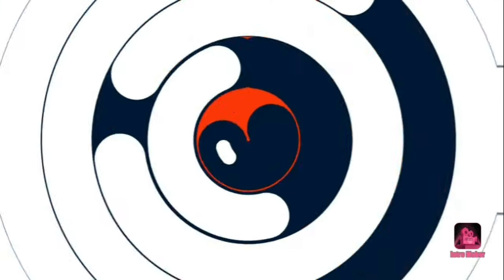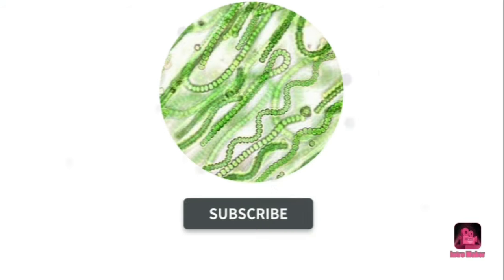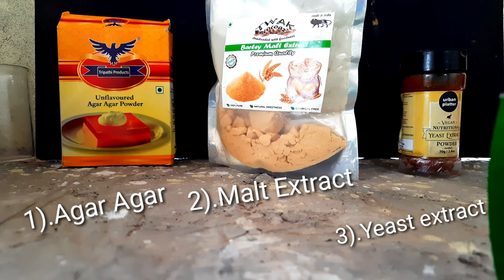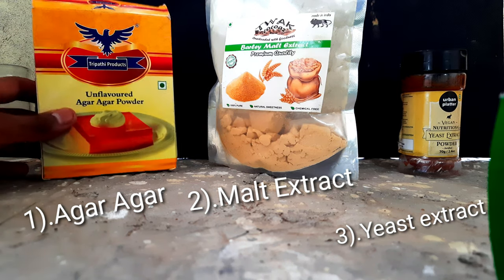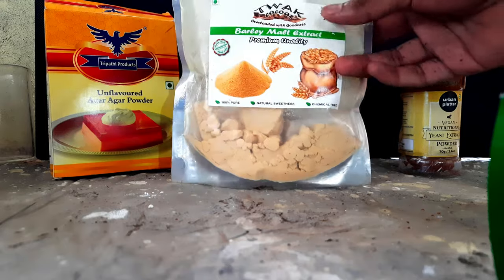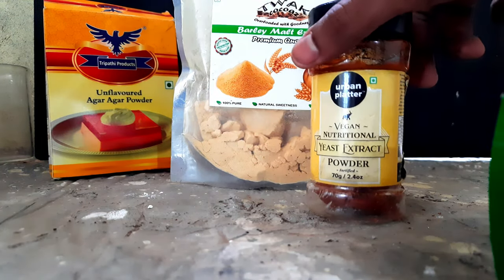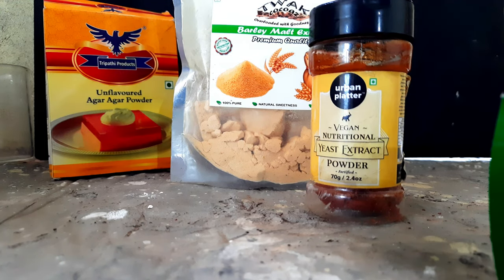So let's jump into this video. Firstly, you need some agar agar powder, malt extract which will be nourishing the bacteria with carbohydrates, yeast extract which contains most of the proteins and carbs as well as vitamins — which is the best feed for the bacteria in the culture.